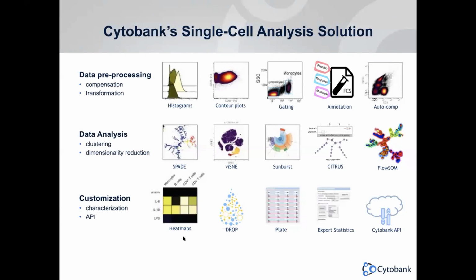There are many ways you can visualize your data in Cytobank. Either you can use a heat map. When you hover over it with the mouse, you will see the 2D dot plots of each subset over here.